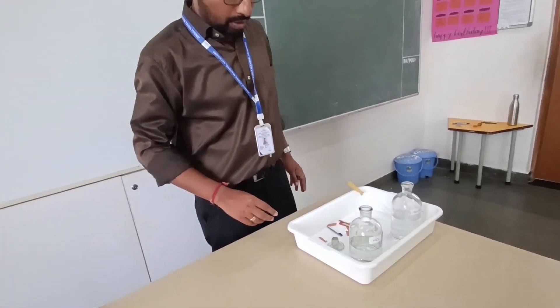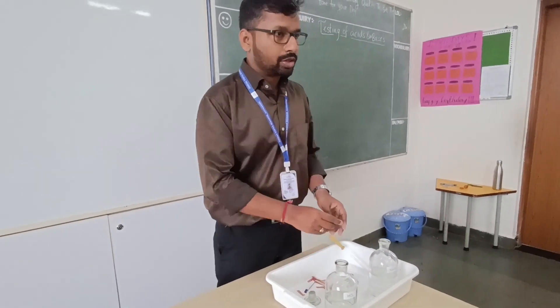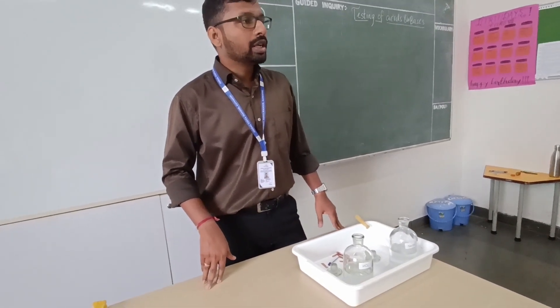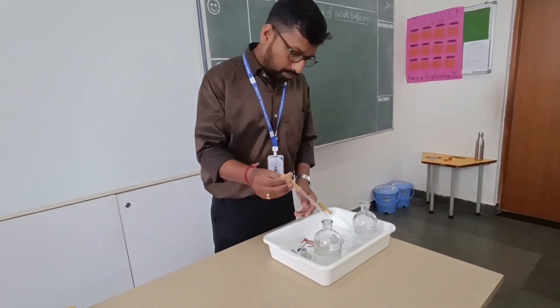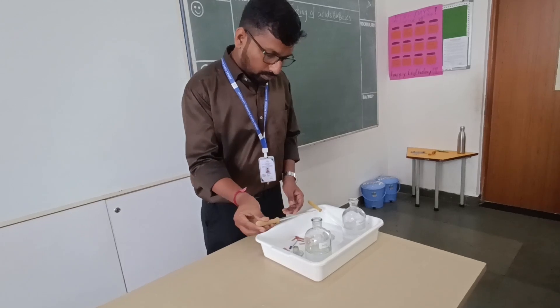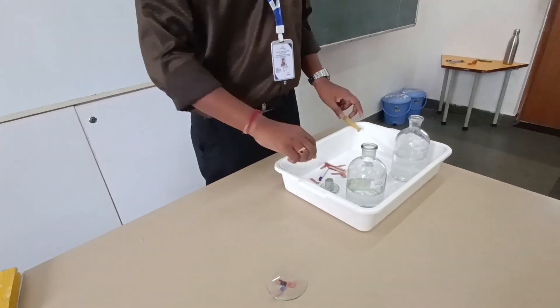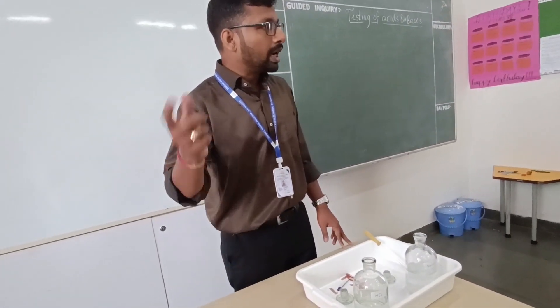Now let us do the blue litmus test. What should happen with the blue litmus when I put acid on it? It will change to red. Let us check that. Yes — it has changed the color to red.